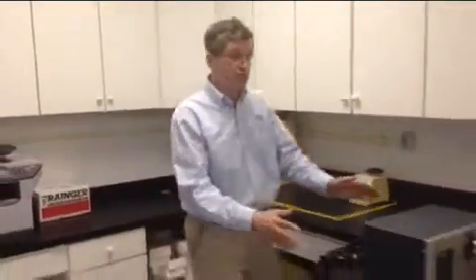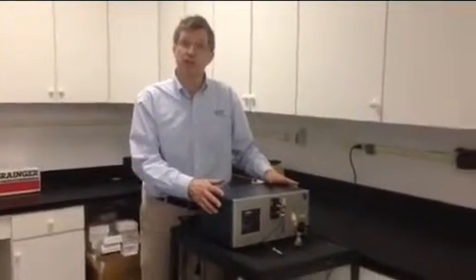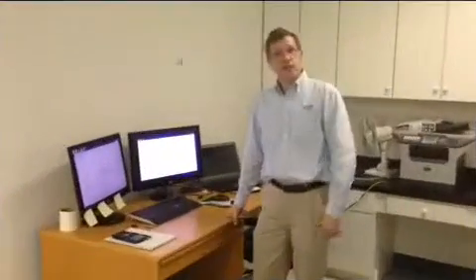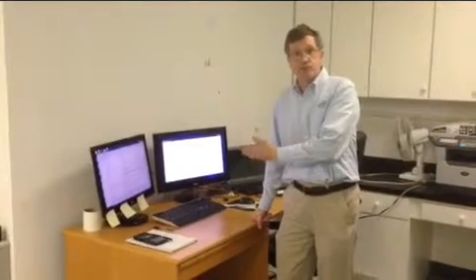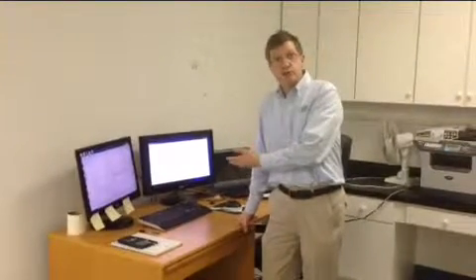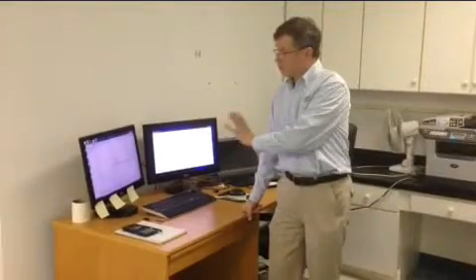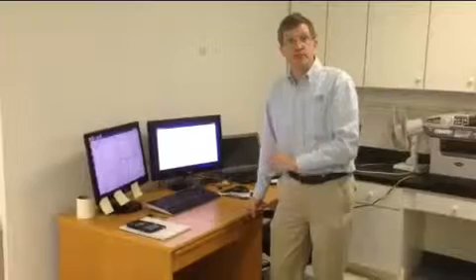We use this new state-of-the-art ARC system that actually we installed literally this last month for doing our radio flow analysis. So this is one of our data processing stations. Here we actually analyze the raw data, generate reports. We may also generate ancillary data that goes into the report. All of that is also backed up on the server system, and we get copies of that made as well automatically.